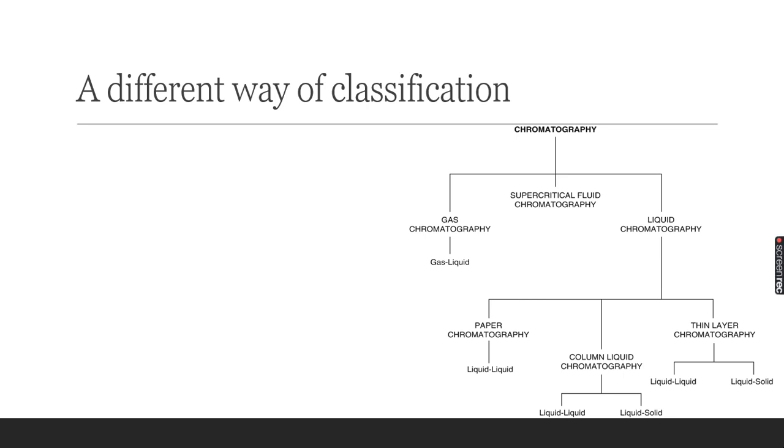In preparative chromatography, gas chromatography has no value here, because most of the compounds are volatilized and are not likely to be recaptured. Preferably we use liquid chromatographic techniques, which are more widely used. Thin layer chromatography can be used for analytical purposes, and column chromatography can be used in both analytical and preparative modes.